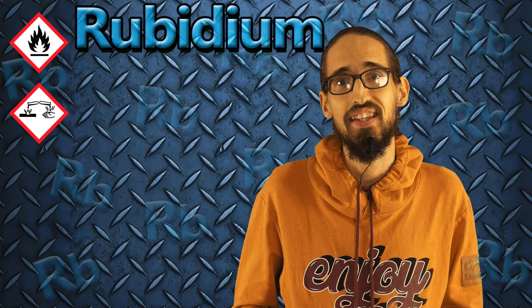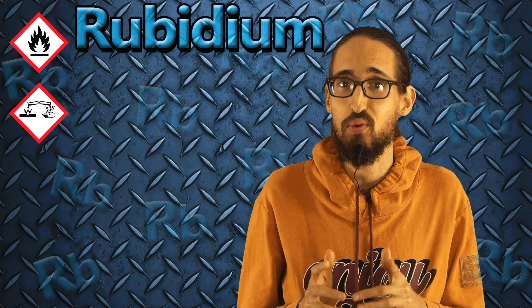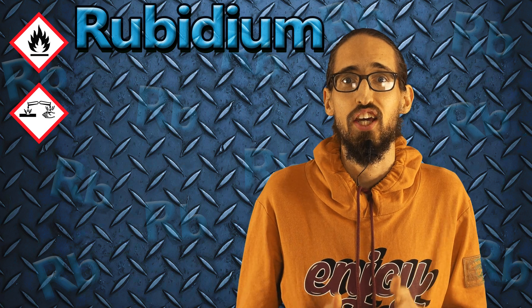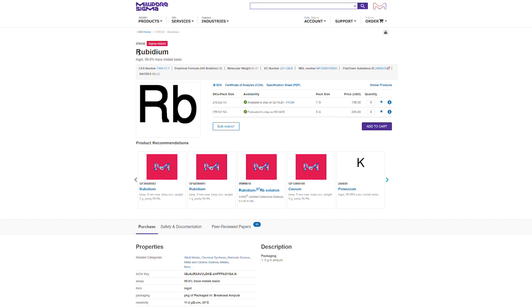Hey guys! The main point of this video is to show what will happen if you break an ampule with rubidium in air. But if you watch this video till the end, you will also see a few interesting reactions with rubidium. Cesium and rubidium are the rarest and the most expensive alkali metals.